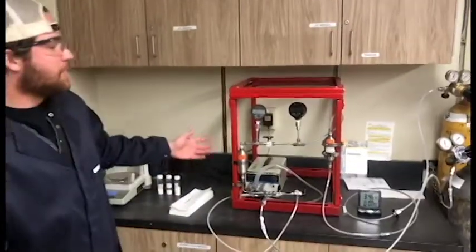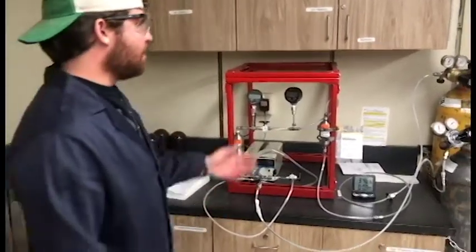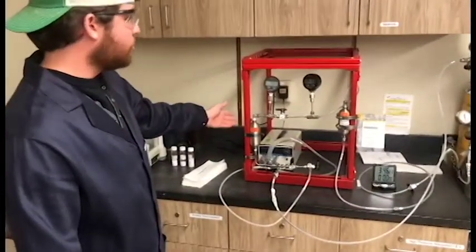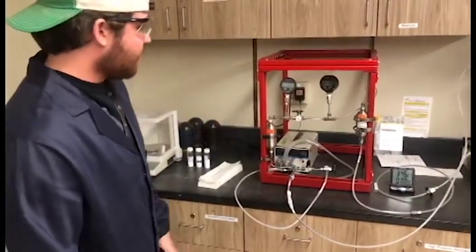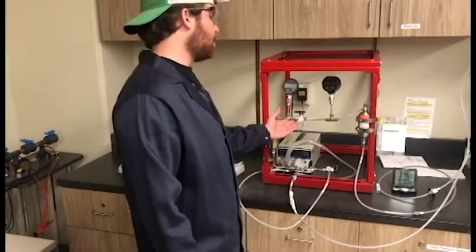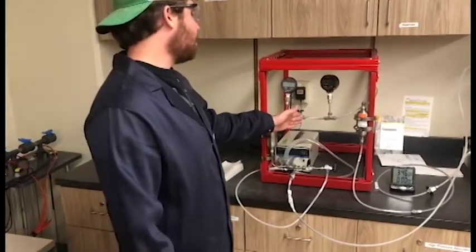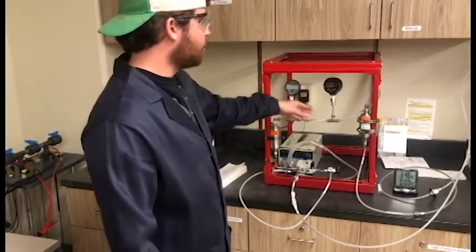In order to execute this lab, we have created an isolated apparatus connected to three gases: argon, nitrogen, and CO2. The apparatus contains two individual chambers, one containing a 10-gram sample of carbon. The key aspect of this apparatus is that it contains many valves and two pressure gauges. This allows us to systematically pressure up the entire apparatus and each section of it, depending on which valves we open and close, and measure the individual pressures subsequently.